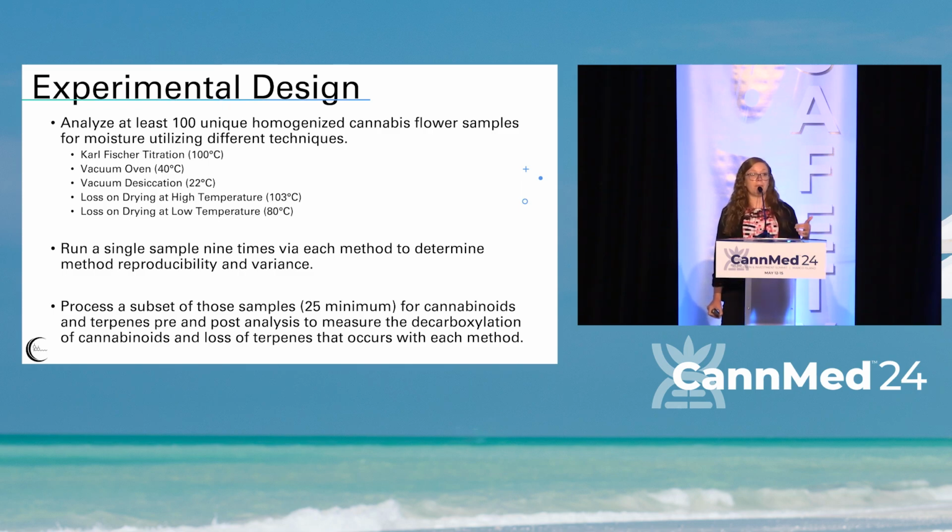We wanted a true comparative study of samples the same day, the same time, analyzed across all 5 of these methods. So the goal was to analyze at least 100 samples. We ended up with 120 samples total for this experiment, and we analyzed them via all 5 of those moisture techniques.